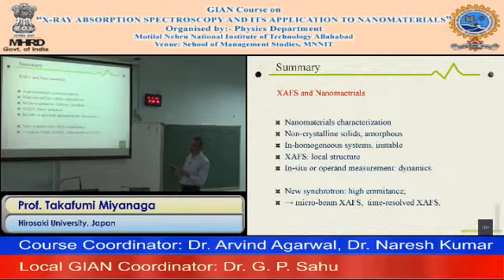So these kinds of dynamics become more clear, and for inhomogeneous states, nanobeam measurement can reveal inhomogeneous systems. So you can use this system to study nanomaterials in the future.